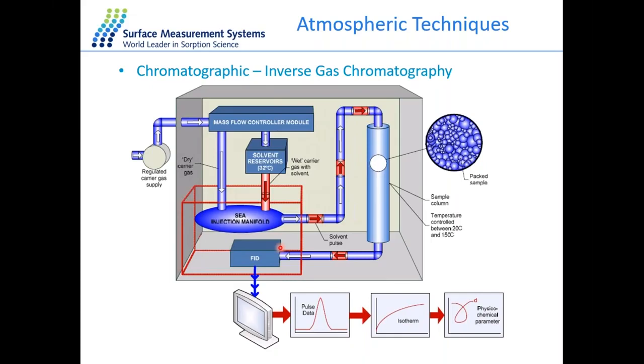I would say as long as the temperature could induce a phase change. So if temperature causes some sort of phase change, if it's a hydrated material, sometimes just drying the sample can collapse the pore structure or collapse the crystalline form. So it's not a one size fits all. But if I just think of a surface, typically I would want to go at room temperature. Maybe there's water or other species that are still on it, and I heat it up to above 100 degrees C to remove all the surface water. I should get an increase in surface area.